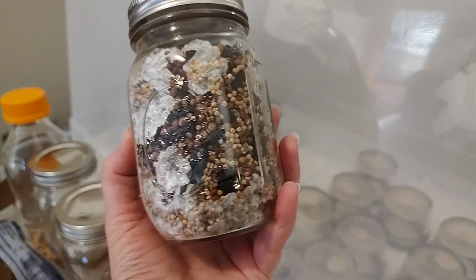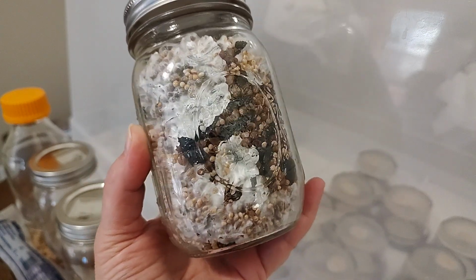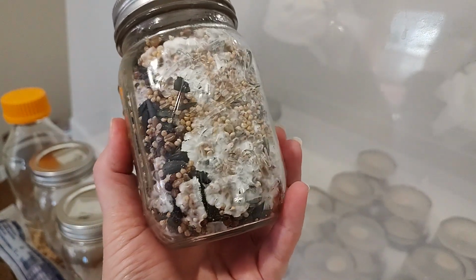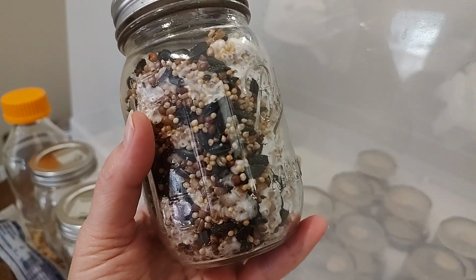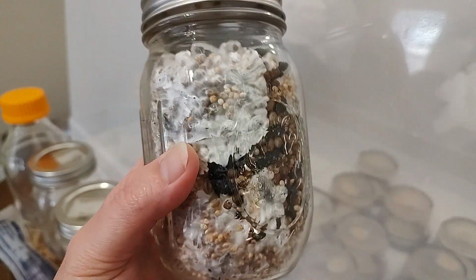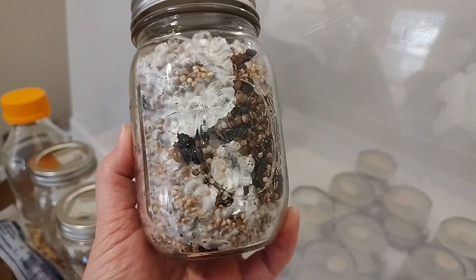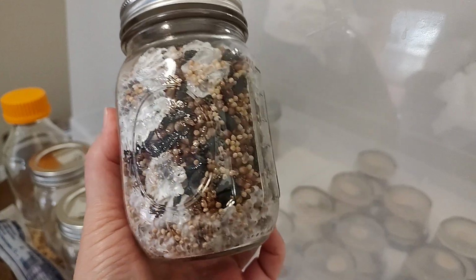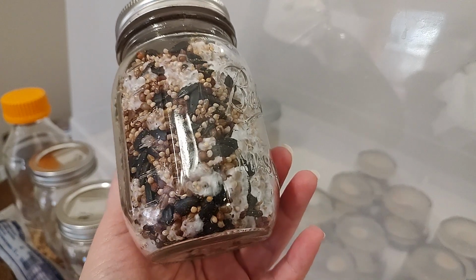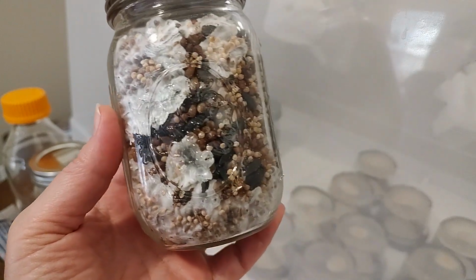And so these jars, these birdseed jars, WBS, have been shaken when they were 30% colonized. And the husband is the one who does all of the grain jar shaking. And he says, this one is almost finished here and we're not going to shake it again because it's looking really, really good. So when all of this rhizomorphic mycelium has colonized and it's all grown out white, then we will move it to substrate, which is the soil, to colonize once again before the fruiting.